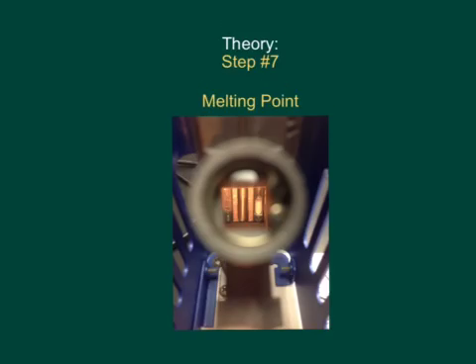Now that we have our pure caffeine after sublimation, we're able to use a melting kit to check the melting point of caffeine and verify whether it's real caffeine or not. After sublimation we get our pure caffeine, as shown here, and put it in a capillary tube. We melt the other end of the capillary tube to close it off, because heating up caffeine can again cause it to sublime, turn into a gas, and evaporate out of the capillary tube.